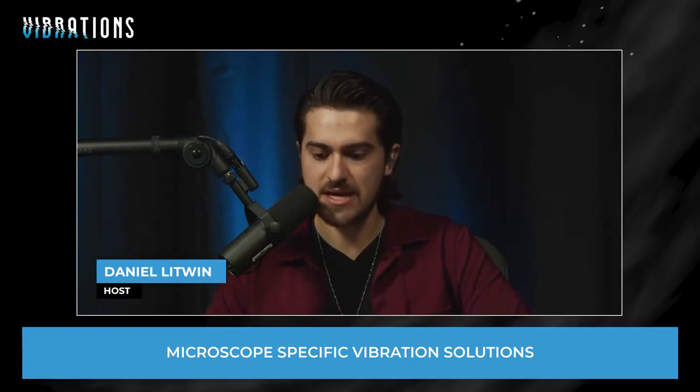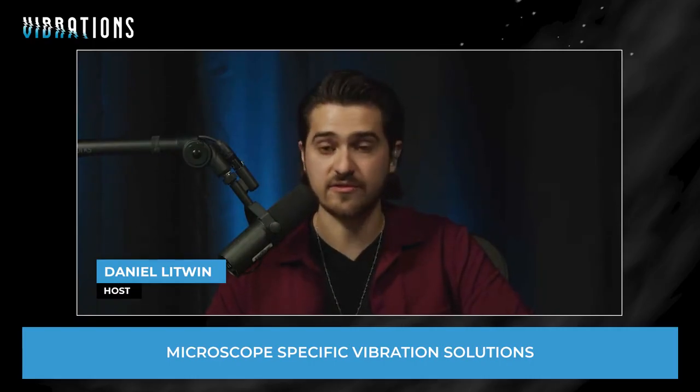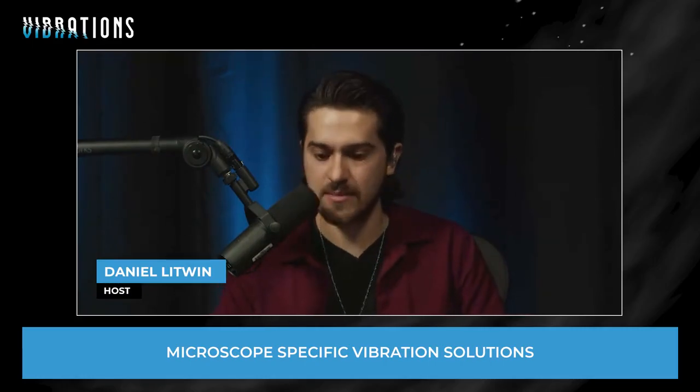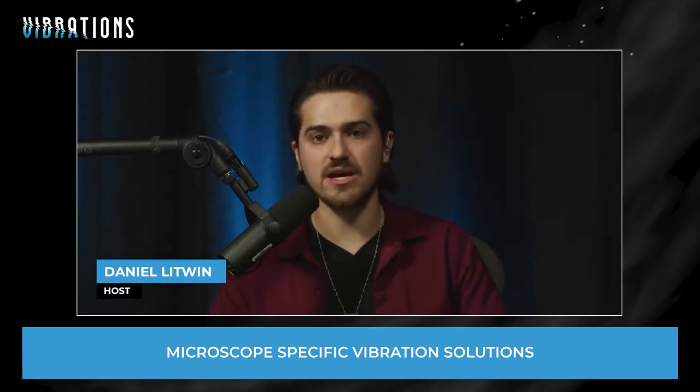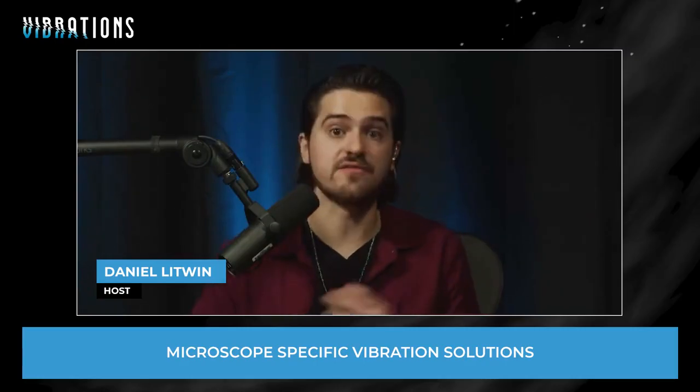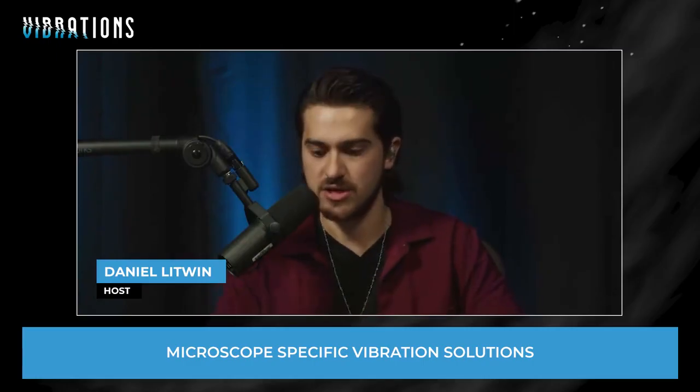So we're going to be exploring common vibration control methods for various microscope types. These include optical, SEM, TEM, AFM, right? And we're going to discuss some of the differences and needs for example, semiconductor failure analysis versus conventional lab use, right? And these microscopes in practical situations.